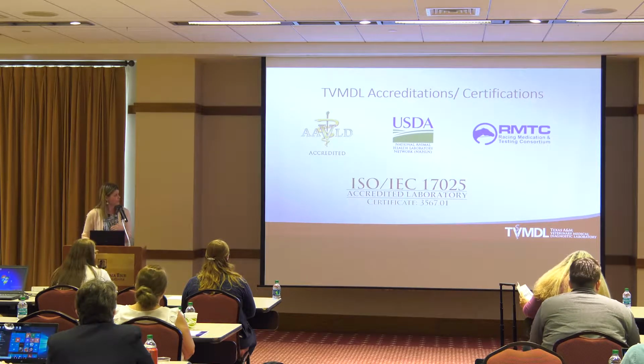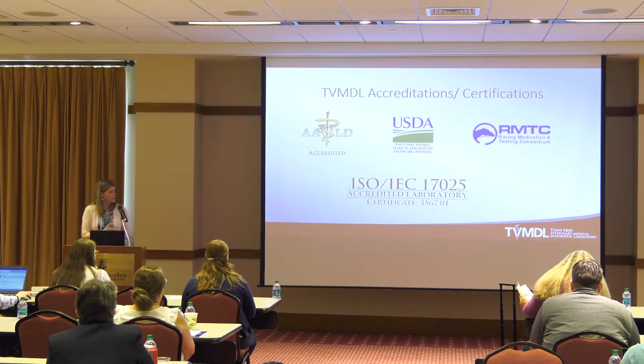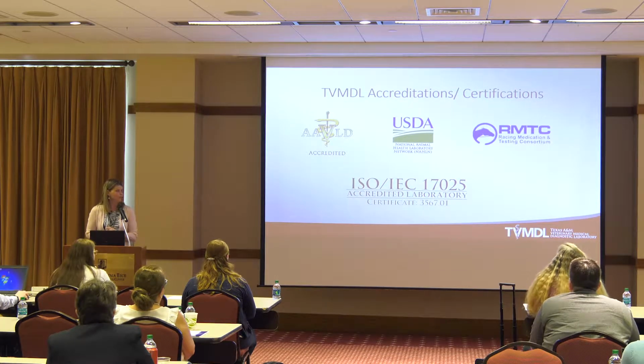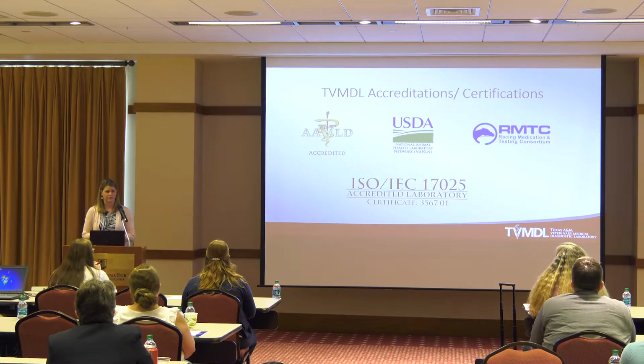So we have multiple accreditations. I mentioned AAVLD and ISO 17025. We are also a level 1 laboratory for the National Animal Health Laboratory Network. So they certify us based on our other accreditations and proficiency testing. Proficiency testing is a big part of our accreditation for the NAHLN. And what we do there is, in the event of an animal or disease outbreak, we would be one of the testing labs. So we have biosafety level 3 labs. In an event of an outbreak, we would be one of the testing laboratories.